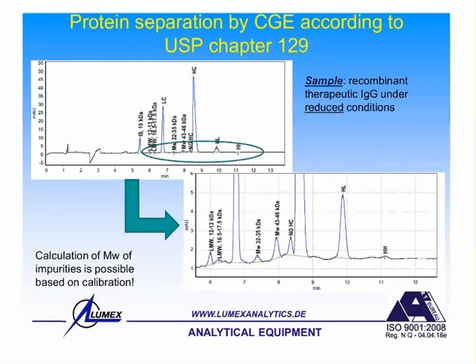Yes, it can mask other anions if nothing is done to pre-treat the sample. But in most cases, believe me, what you need is to dilute it properly.